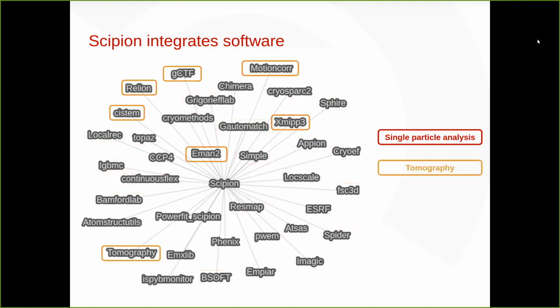But recently, we've been working on tomography, and this is not released yet, but some of the software that can estimate or be useful for tomography will be added.